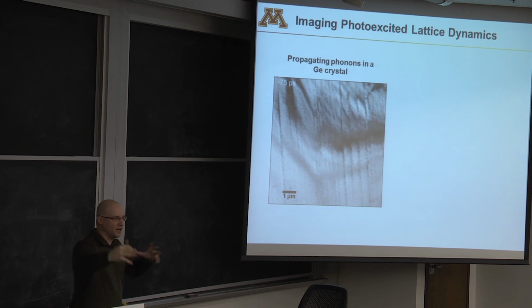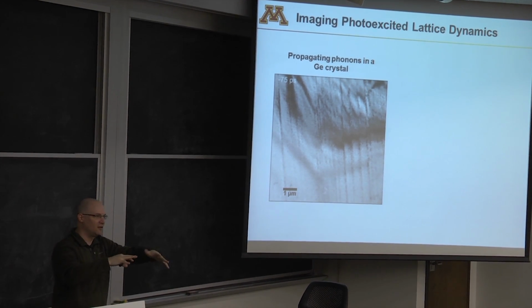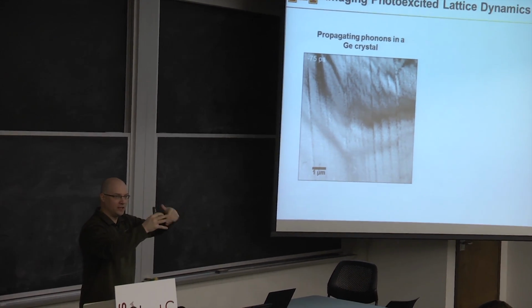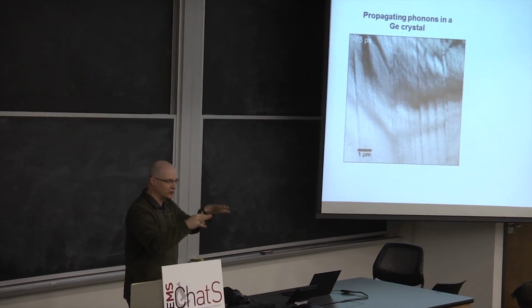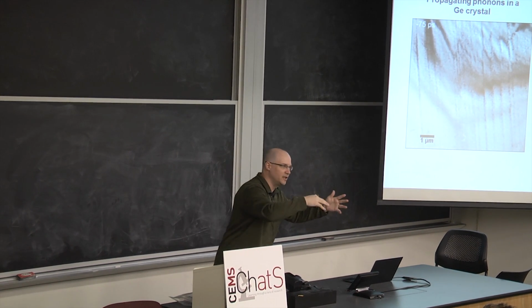So now these things are going crazy. What they're going to do then is there's different modes because of different bond strengths in different directions, different spacings. They start to couple together. It starts going crazy, right? And then pretty soon these things start to kind of settle down. They're high energy and, okay, it's been a couple picoseconds, I'm pooped. I'm going to just settle down now. But they end up coupling their energy into other modes that are much lower energy. They're a bit slower, they kind of slosh around a little bit.